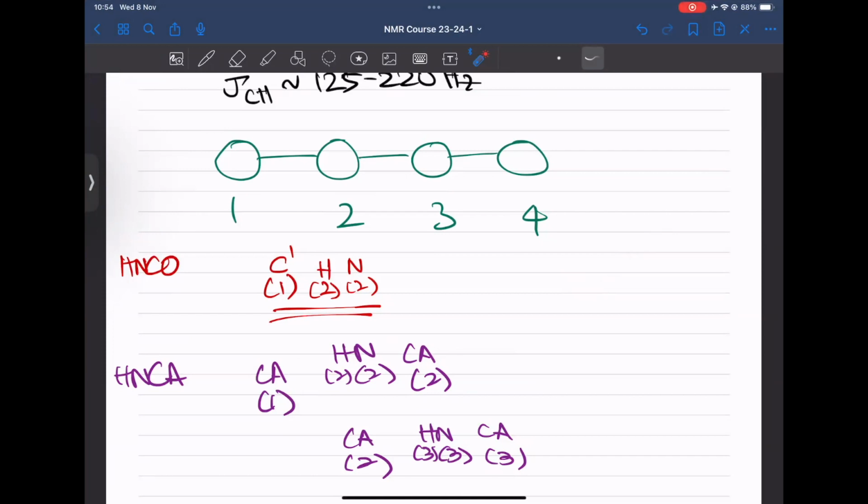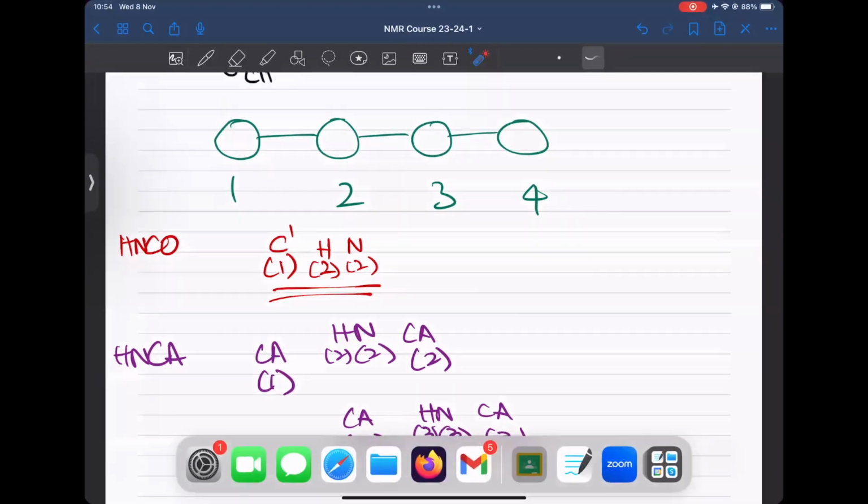How can we jump down with carbon coupling to the adjacent carbon? It's through the scalar coupling. I'll come to that point. Maybe I'll touch on that tomorrow, because if I tell that right now, it'll be confusing. So the question that Shivam is asking, which is a very valid question, is that when you're applying a pulse on the carbonyl, why does it not affect the C alpha? Because it's the same channel. Correct. So it's a very valid question. Maybe I can give the answer.